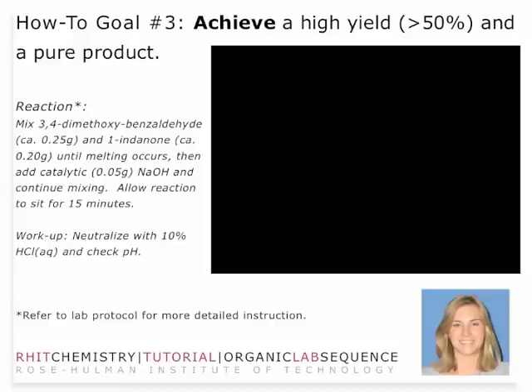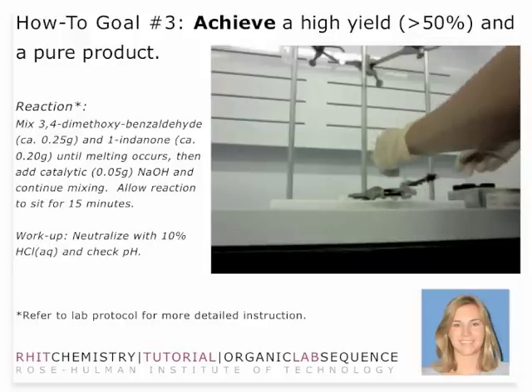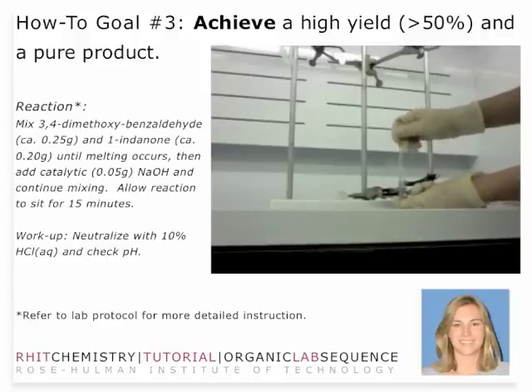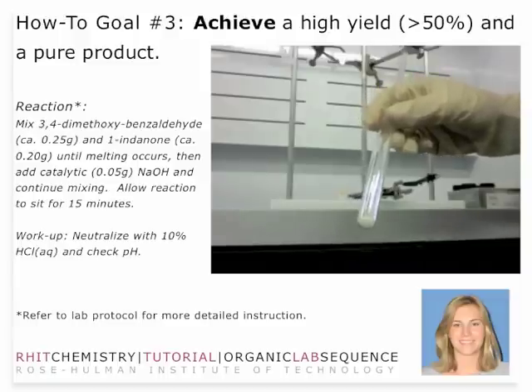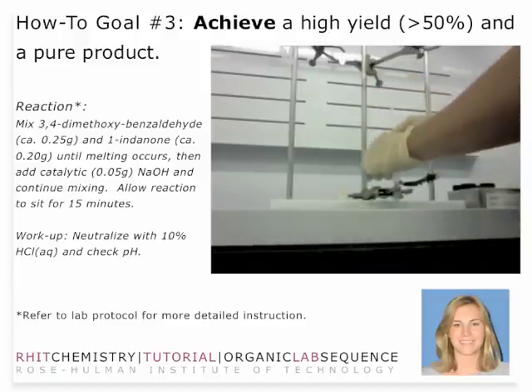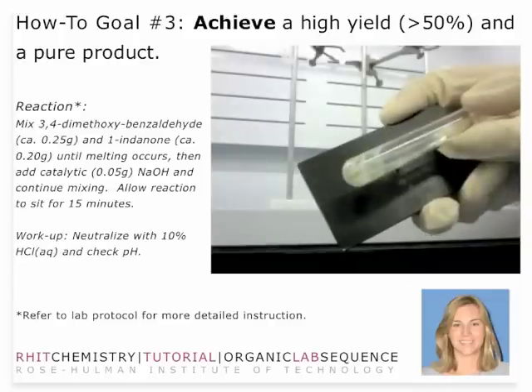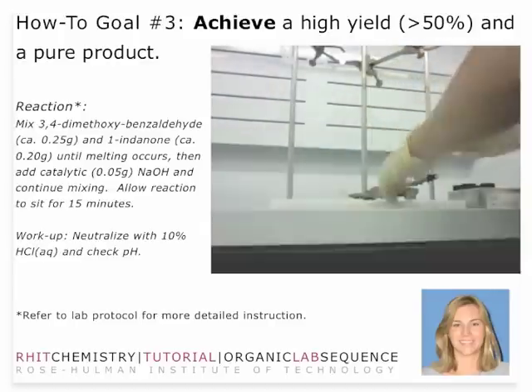Here is an example of the reaction, done in a test tube. Notice that here I'm adding the reagents to the test tube, and I've clamped it. The most important thing is that you don't put the test tube in the palm of your hand and stir it using a glass rod — that could cause problems since the bottom of that test tube is pretty weak. There's the white powder — that's what it looks like after you first mix them. Then you continue to mix, and you'll see the brown liquid. That's what you should observe after a couple of minutes of mixing.